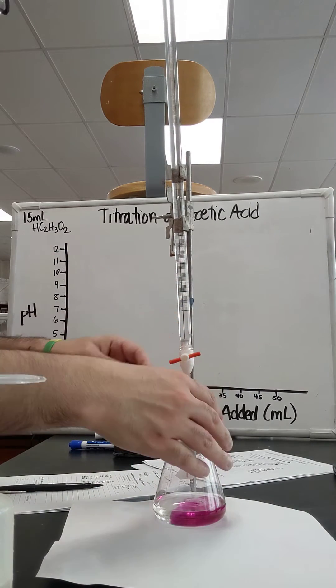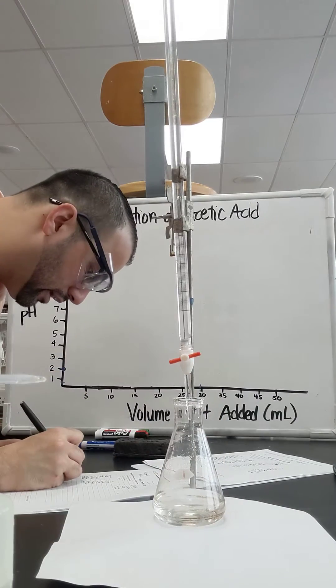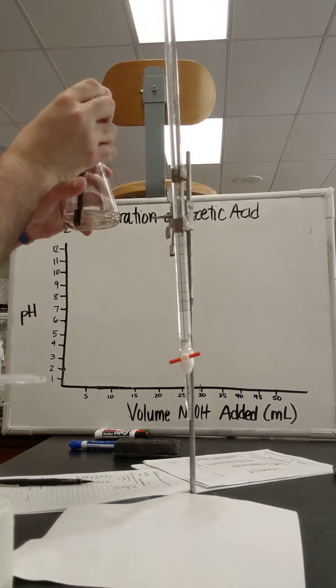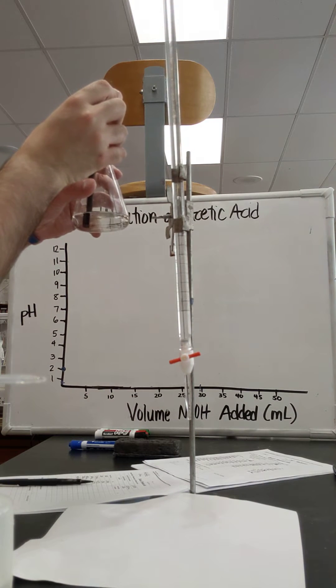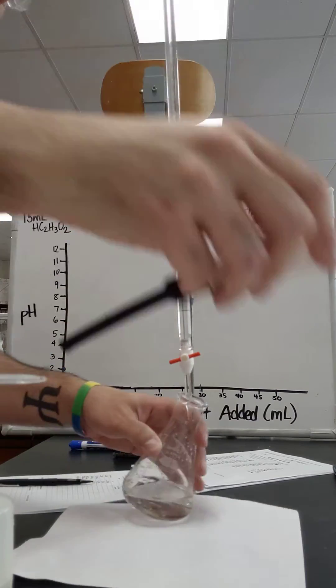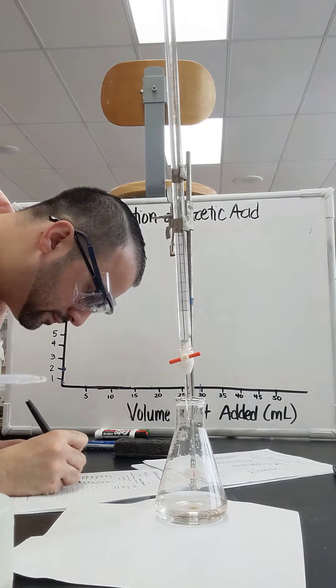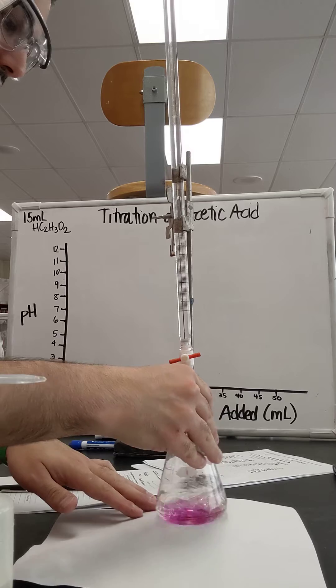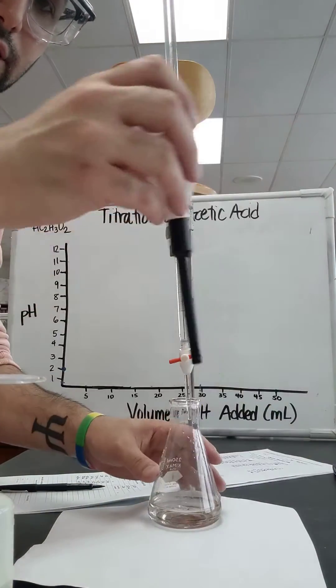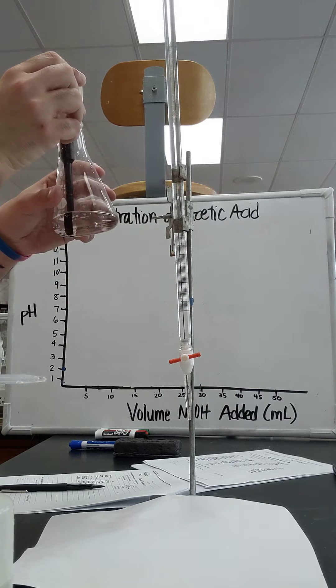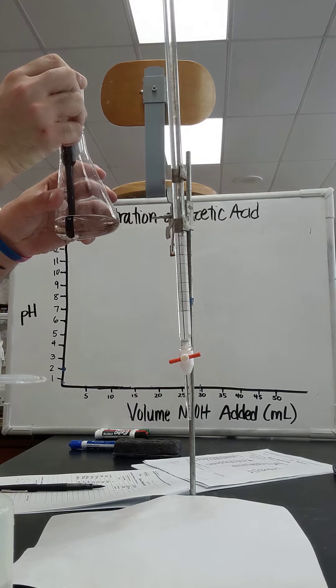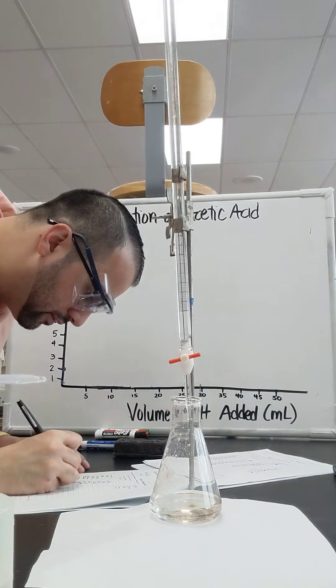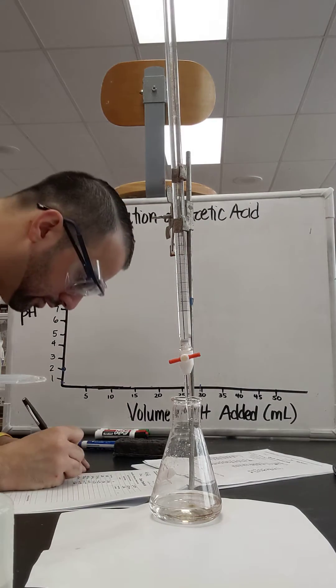And my pH is about 4.83. Got a steady climb here. Another milliliter, got 7 milliliters in here. And the pink, you can see it in the video underneath the white that it's getting broader and broader. We got 5.06 after dropping up until 7 milliliters.